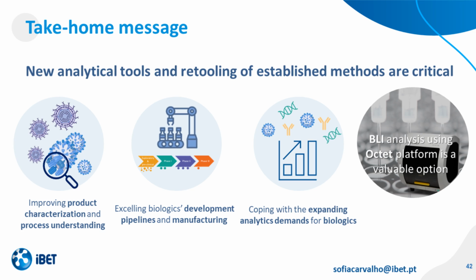The last question for the webcast is, what blocking reagents were used for blocking HCPs or in-process material? Yeah, so the blocking reagent that we use is the one that is provided by Sartorius, the kinetics buffer.